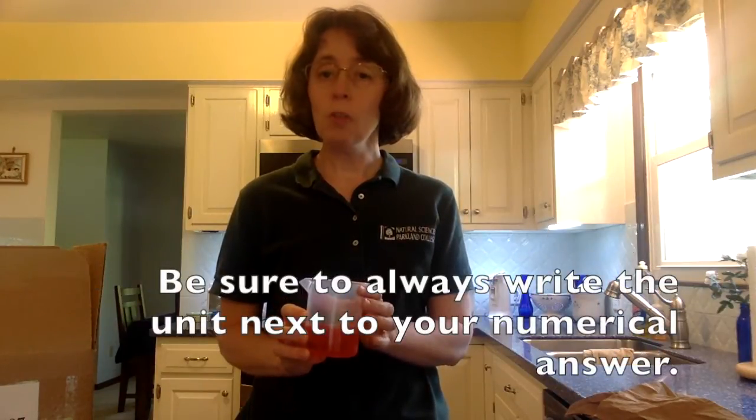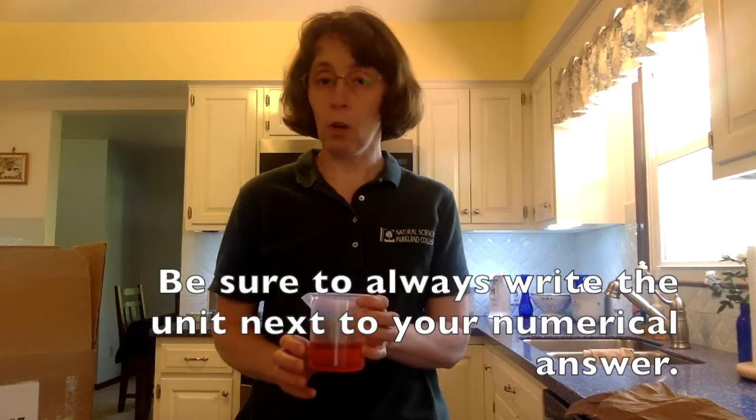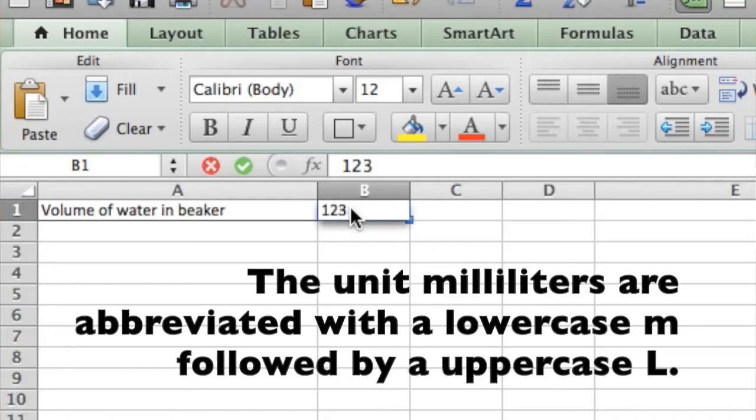Be sure to always write the unit next to your numerical answer. The unit milliliters are abbreviated with a lowercase m followed by an uppercase L.